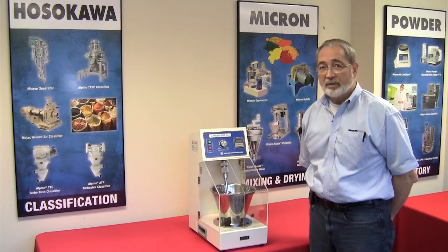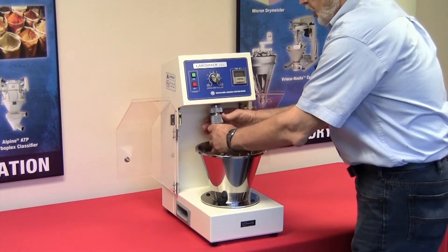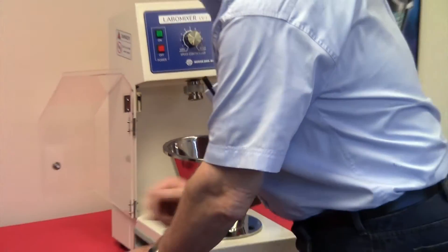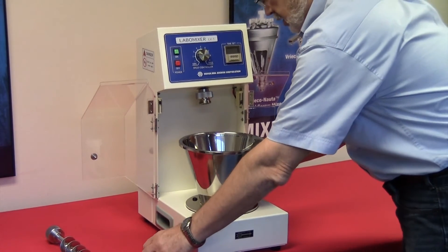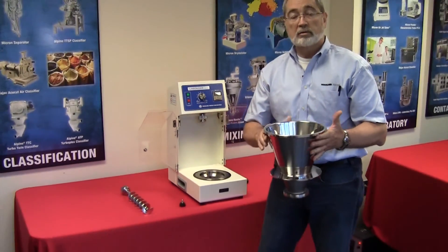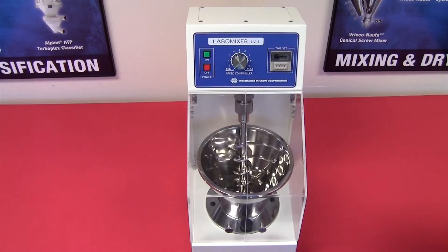To either change the batch or to disassemble the unit, simply open the doors, unthread the mixing arm, remove the mixing arm, set that aside, remove the two hold-down buttons, and simply elevate the vessel. At this point, the material can be discharged and or recharged depending upon the material or the process that you're working with. The mixing bowl is a two and a half liter capacity, and it is also mixing-effective at 30% of the volume.